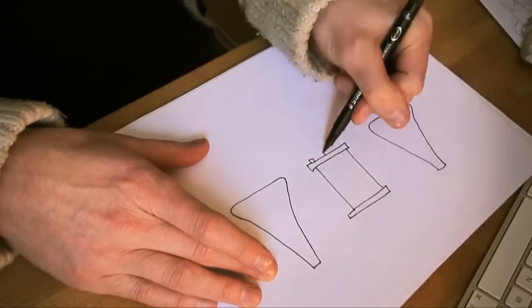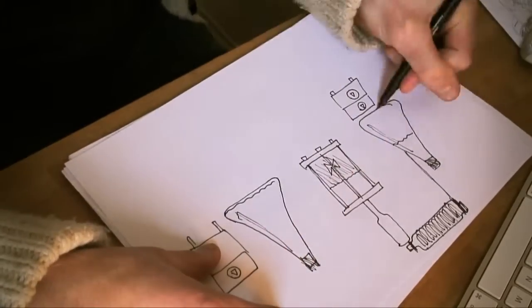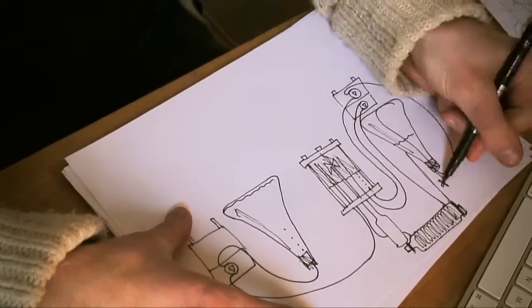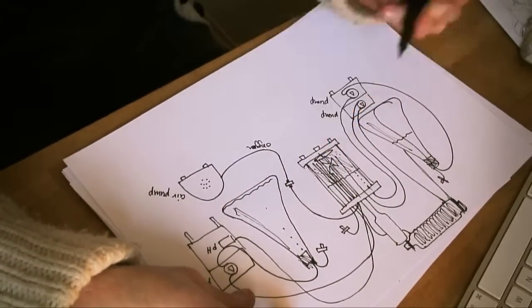To control stress parameters as light, the work employs a fermentation setup called a chemostat. It consists of tubes, vessels, and monitoring parts, all connected in a functional manner to maintain homeostasis in the cell population. The machine is both hosting and feeding the bacteria and draws analogies with artificial organs and lifelike machines.